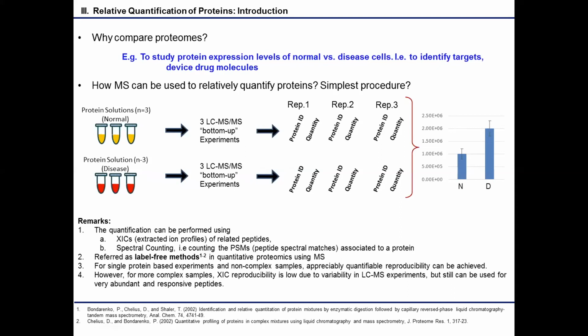Whereas Western blot is going to give you a measure based on antibody affinity, mass spectrometry can actually give you sequencing. In this case, when we're talking about label-free and some of the subsequent approaches that Aruna will talk about, you actually get sequencing, so you get identification of sequence. That is a much higher level of analytical precision than what you get with a Western blot.